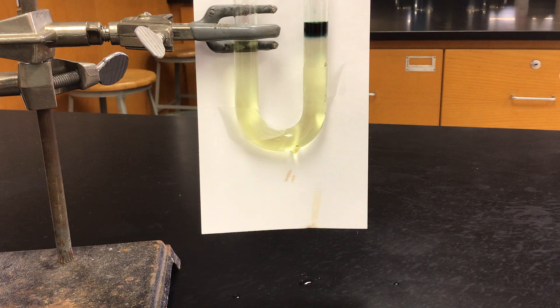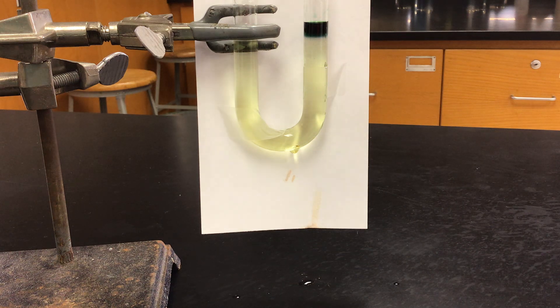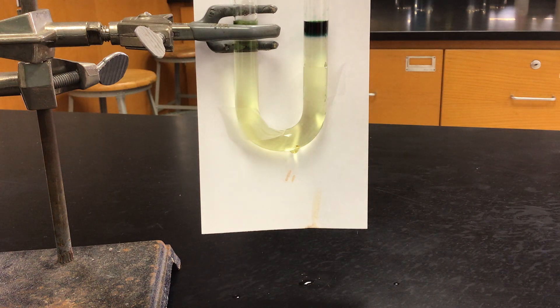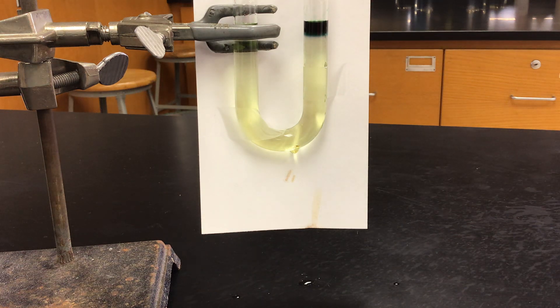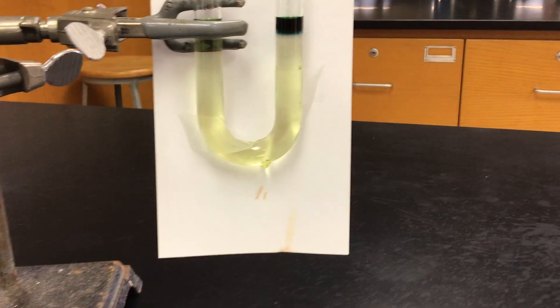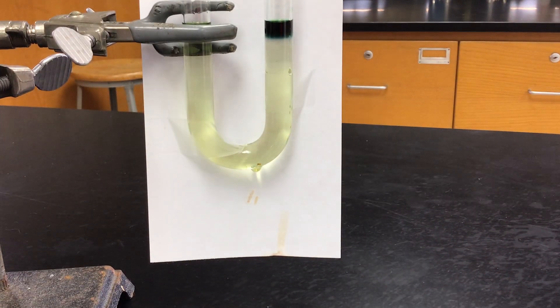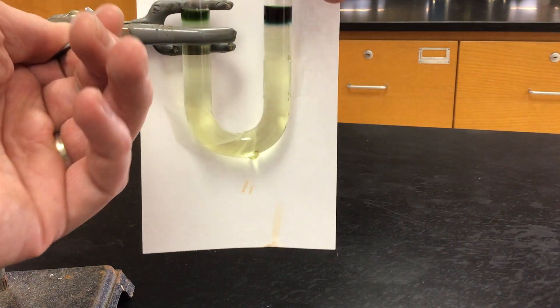And I'm going to add a drop on the left because that pH really shouldn't be changing, and it should be kind of green. I think what I'll do is maybe move the U-tube around and the clamp so we can kind of see what's going on here.